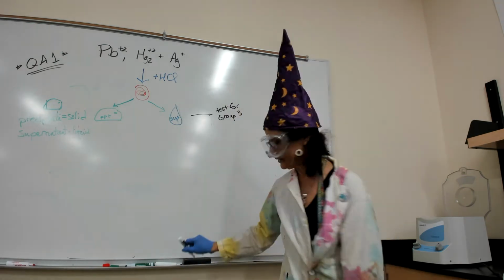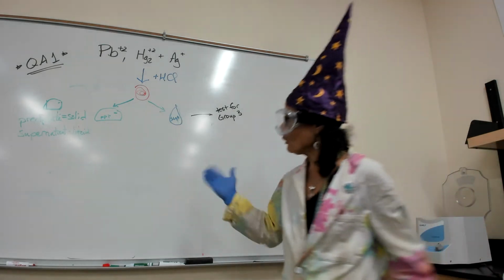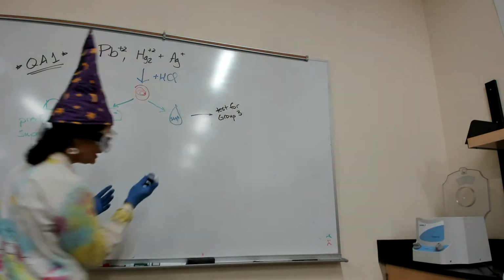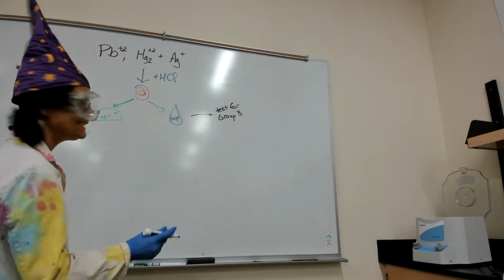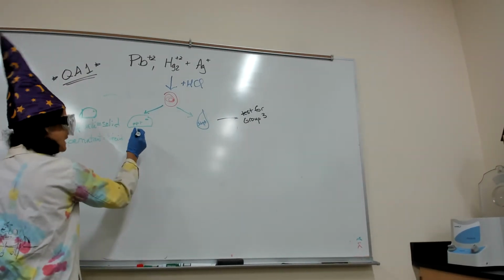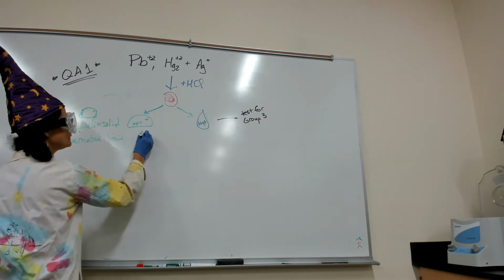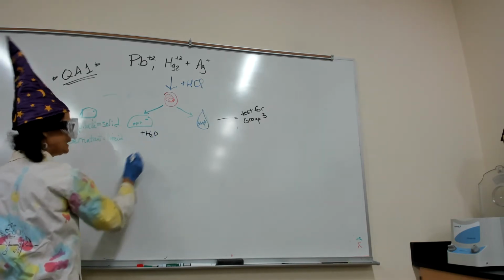We're not gonna do group 3 today. And it's heating away. Now, what happens is our next step, and I'm gonna use black for all this so you guys can see what I'm doing here. You can see me a little bit. All we did was we added some water and then we added heat.